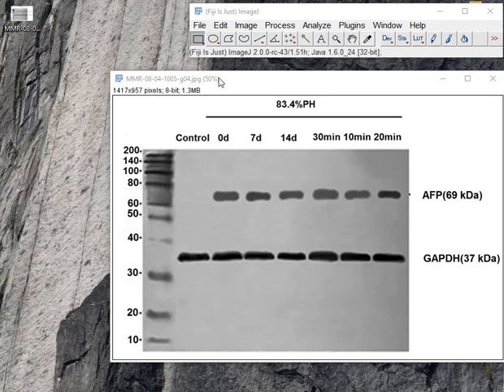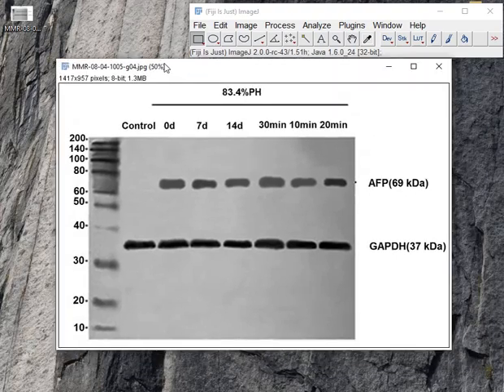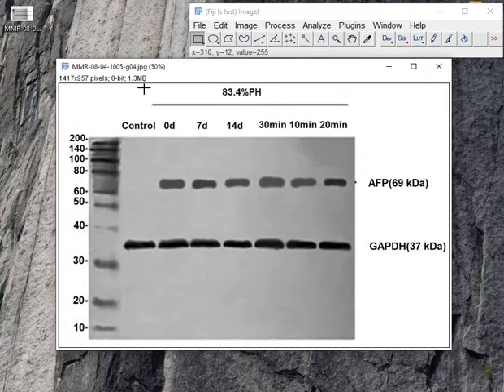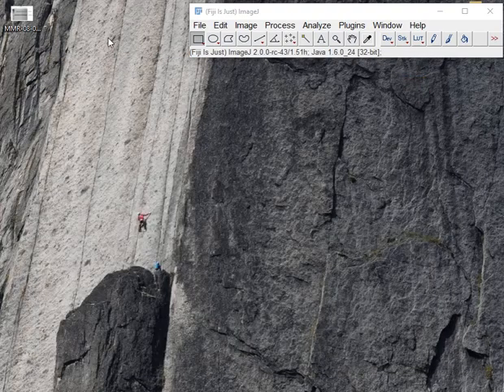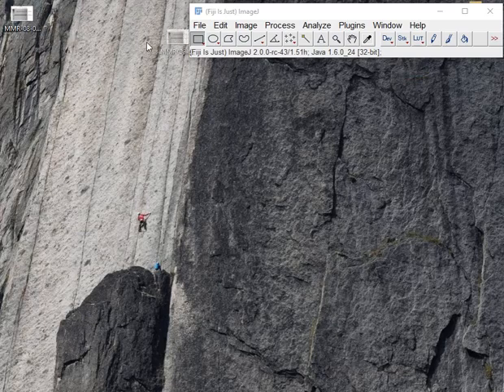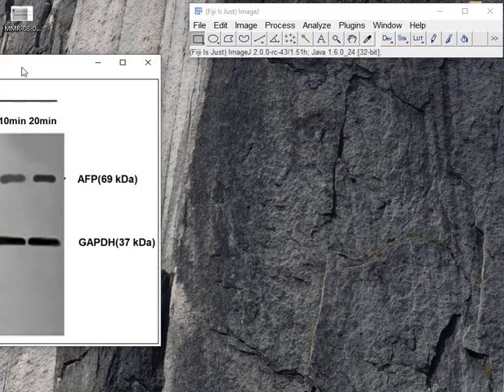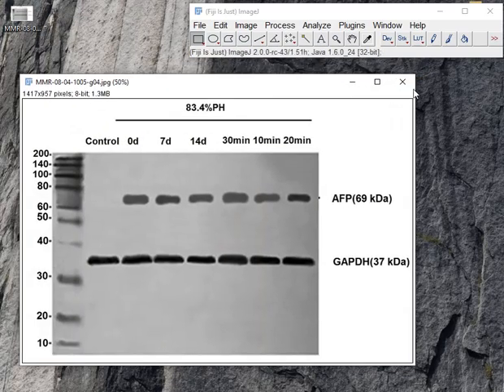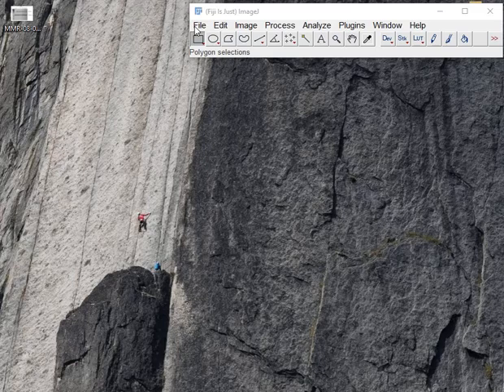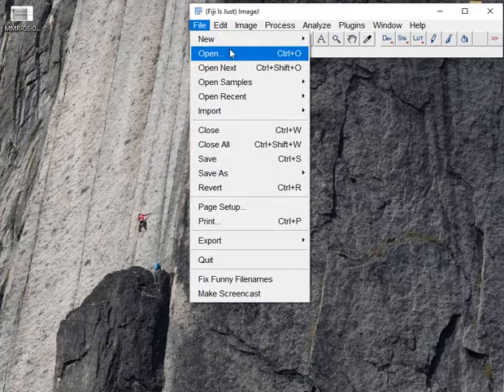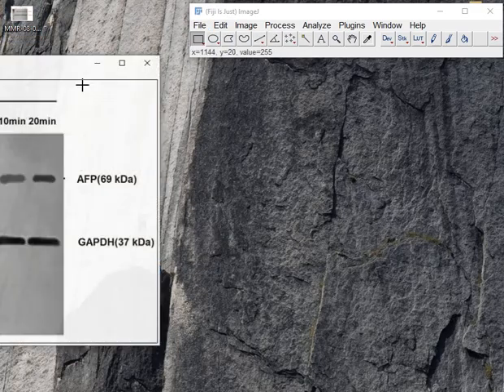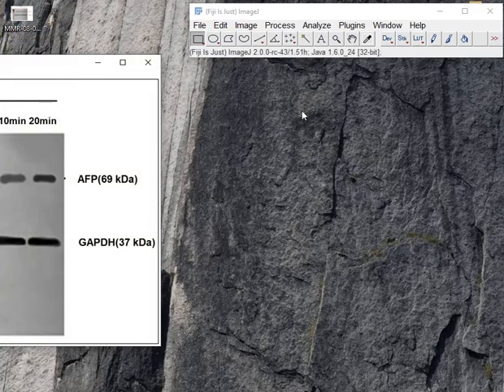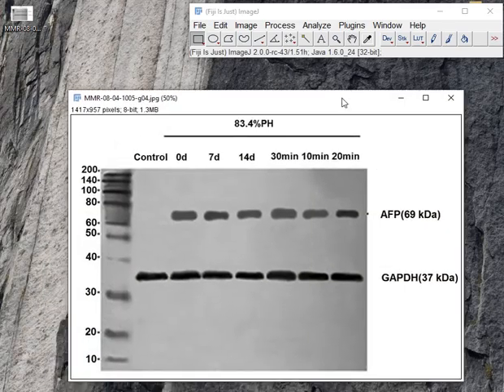For analyzing the Western blot, I have a picture as you can see. I open the picture by dragging it here, or you can just open it with file open. So here is my figure.